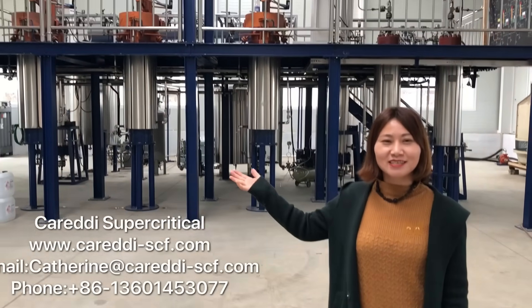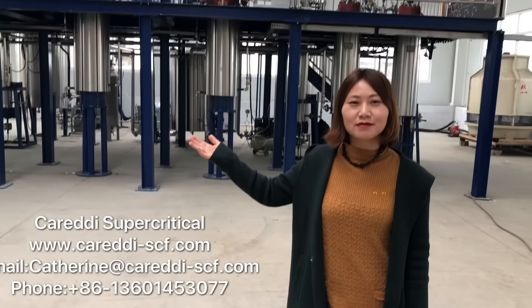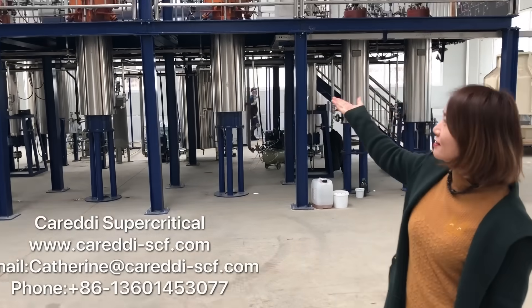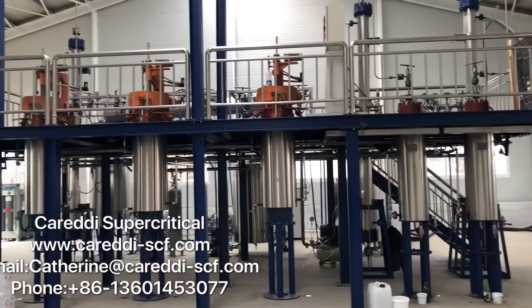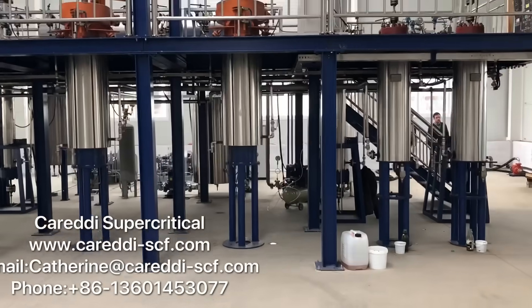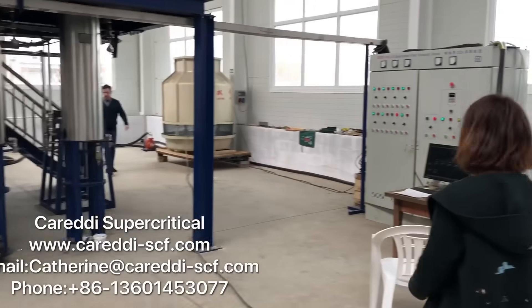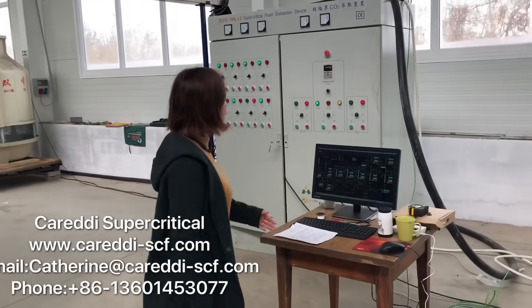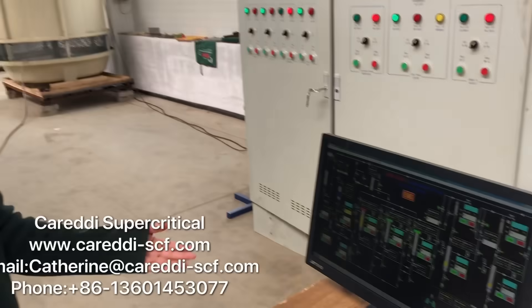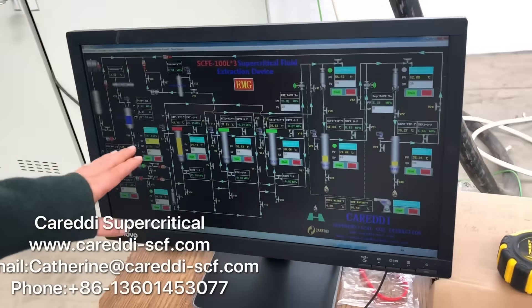Let me introduce our large-scale supercritical CO2 extraction machine to you. This is the 300 liter plant we installed in Hungary. It has three extractors and two separators. It's a fully automatic PLC controlled system.